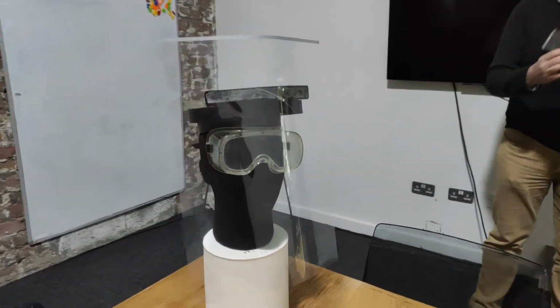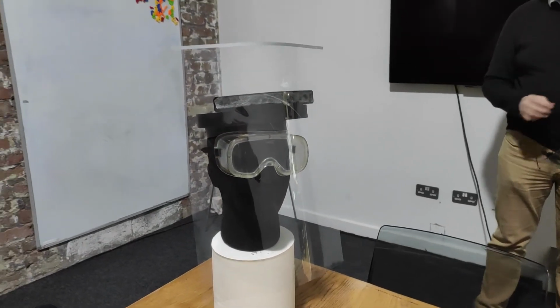So this is the third of our prototyping sessions today at DoES Liverpool. This is another laser cut example, following on from the second that you may have seen. This design was created in-house here by one of the founders, Adrian McEwen. And what he's trying to do is optimizing for materials use and also for speed of manufacture. So I'll hand over to Adrian so he can explain.